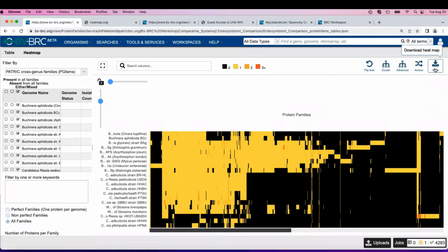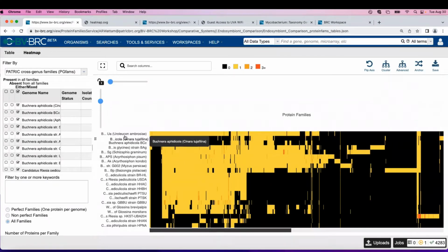I can arrange this in phylogenetic order right now. What I do, and I do a lot of work with Adobe Illustrator because that's where I generate most of my figures, is I put the tree there and then I line it up with the heat map, because that particular application is really good for me to do that. But right now we don't have it that way, but you should know because you just ran these things on a tree. So you can grab them and move them into phylogenetic order of that. So each of these can be moved and I can grab these things and move them around.